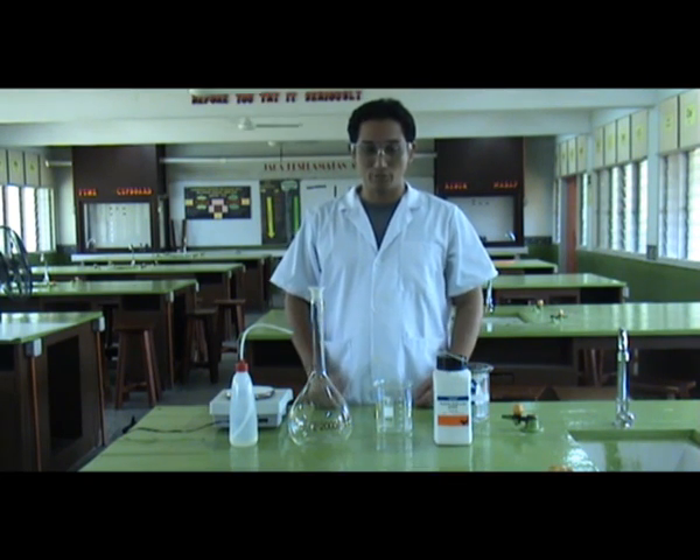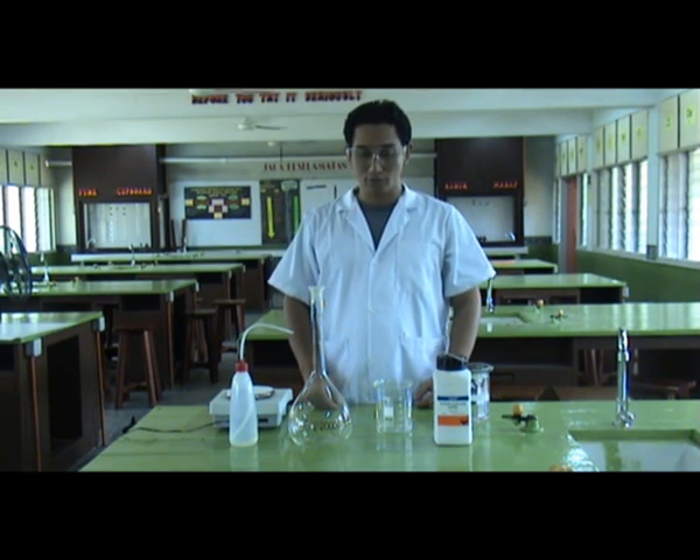Welcome to Phylab's Ministry Experiment. Today we are going to demonstrate how to dilute sodium hydroxide into a one molar solution.